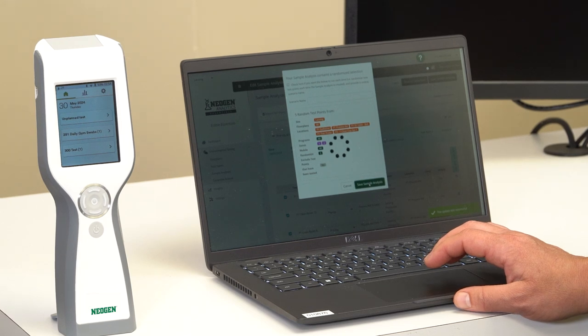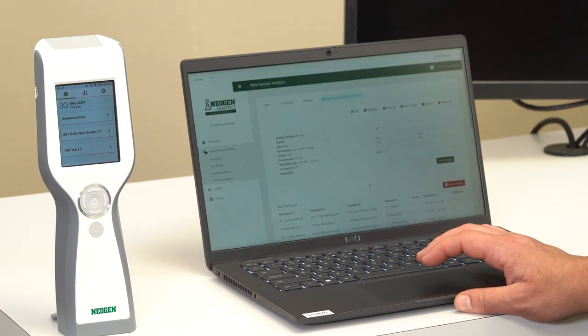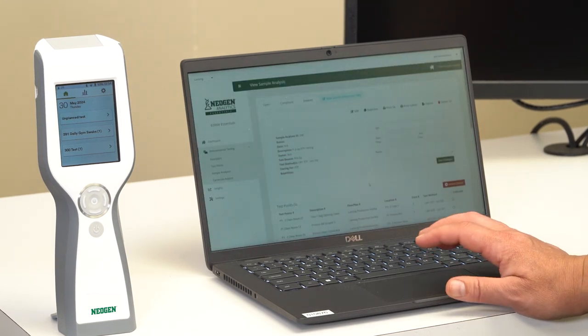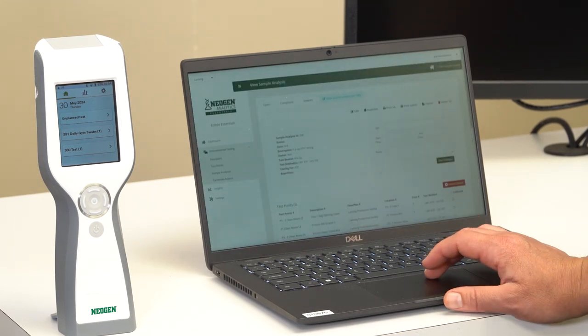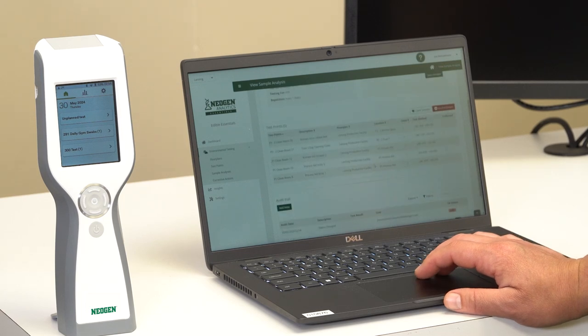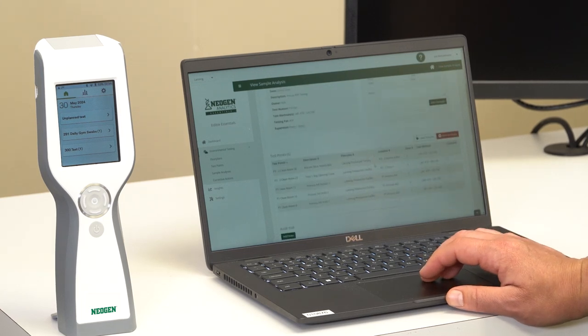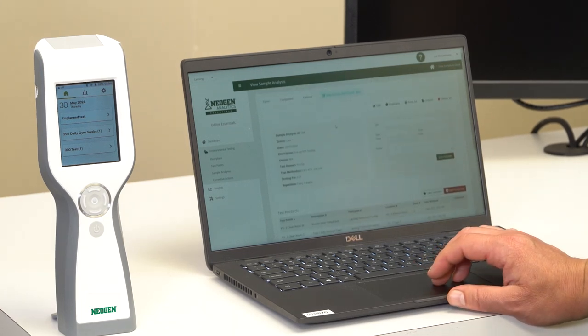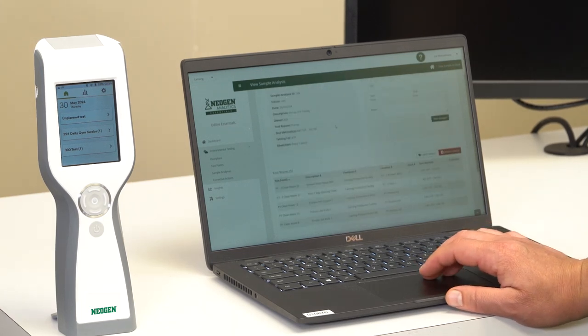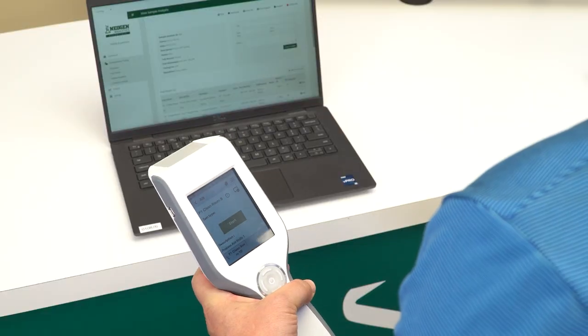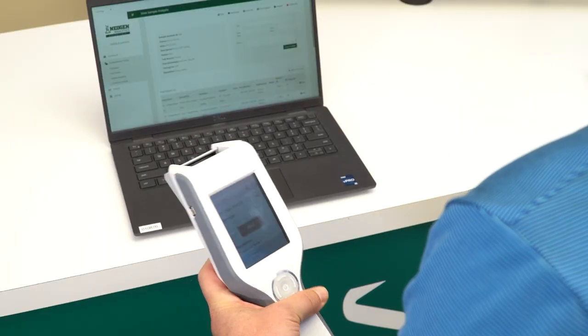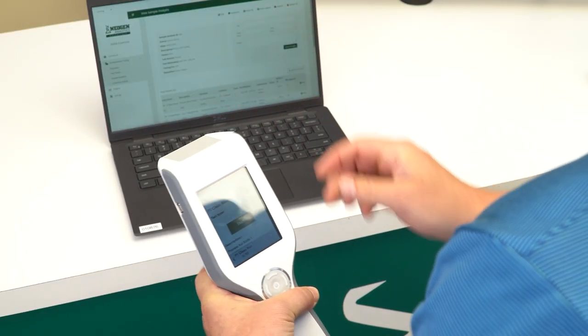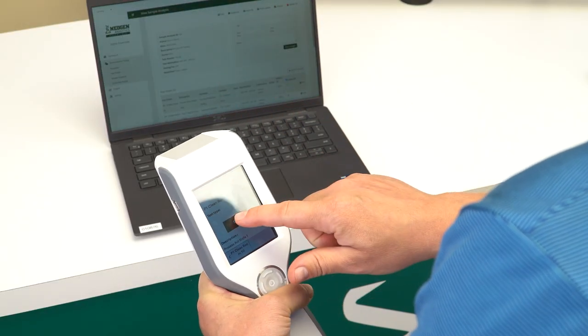Select sync upon powering up the LM1. The device will sync with Neogen Analytics, immediately providing sample plan testing information on the device without having to physically connect to a computer. Perform swabbing based on sample plan and process utilizing the LM1 device.